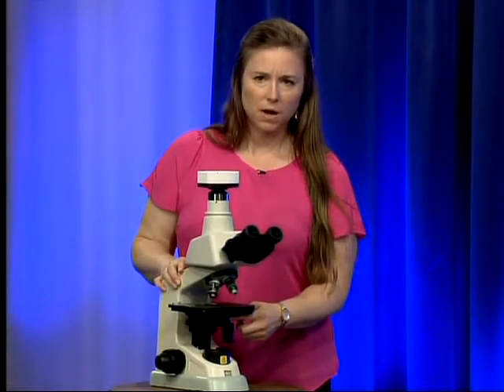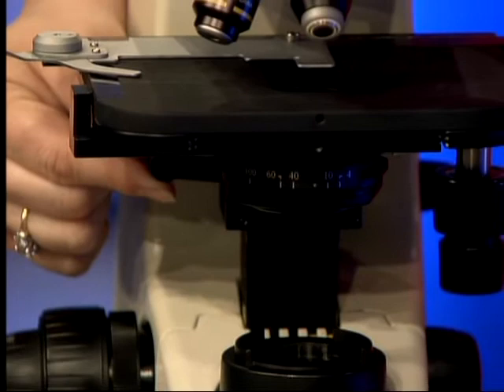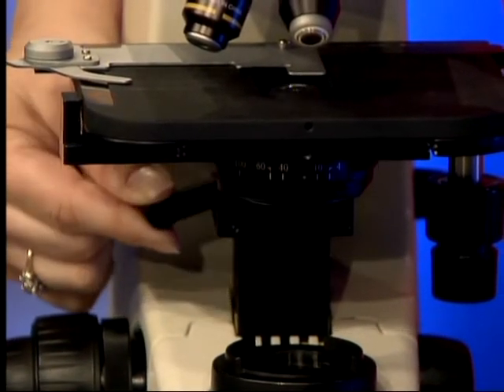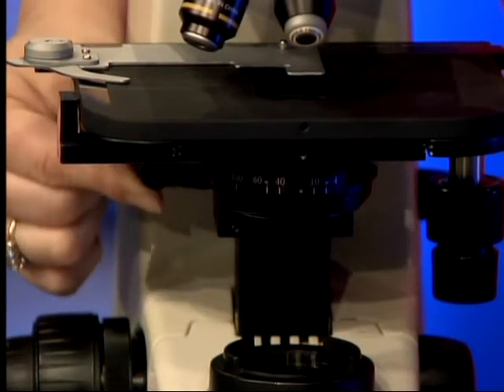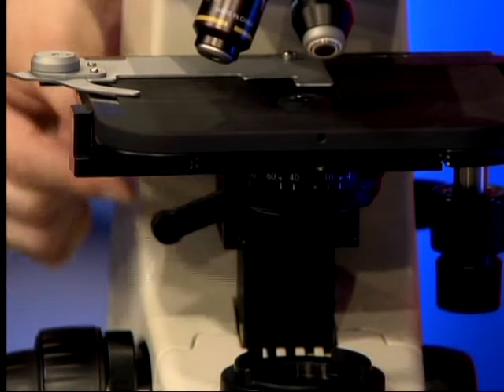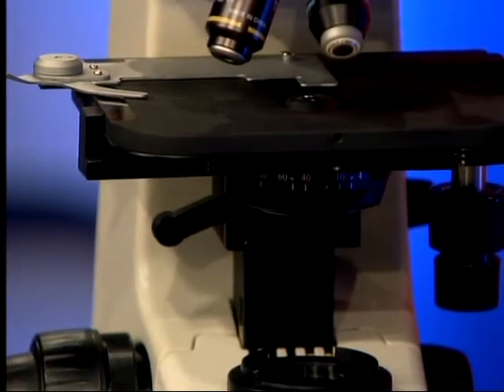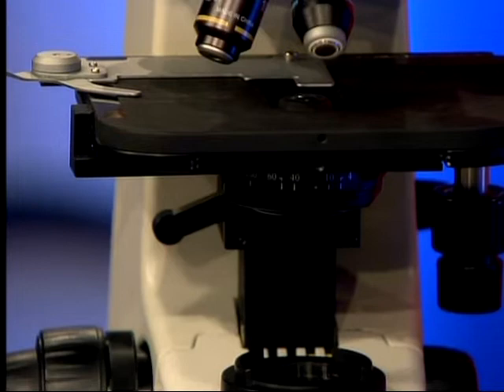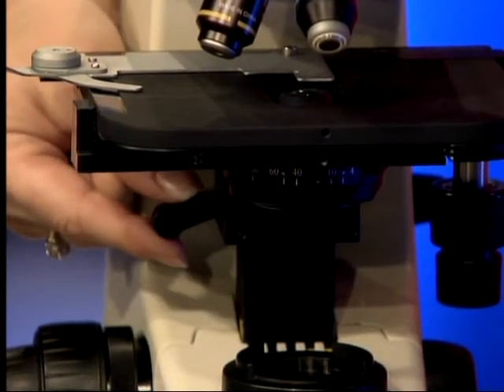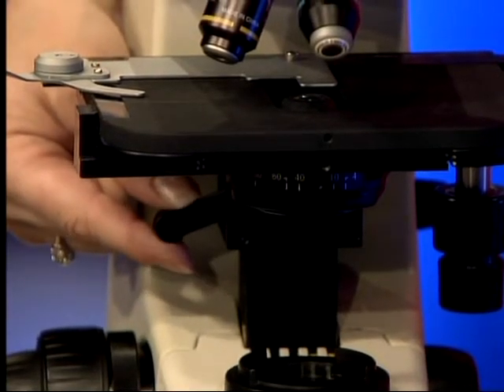Over here on the side we have the height adjustment lever for the condenser. This lever will help you raise and lower the condenser underneath the stage. This is incredibly useful for increasing the contrast and the detail you will be able to see through your eyepieces, helping you better define the cellular elements you are looking at.